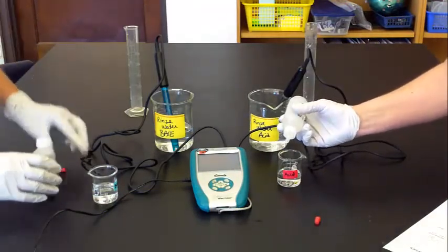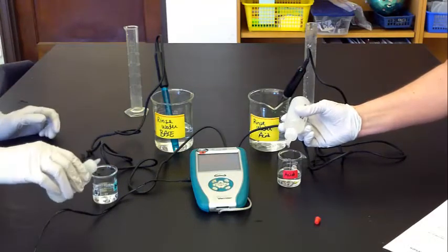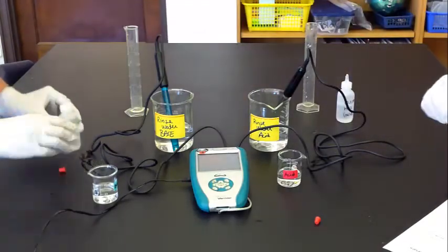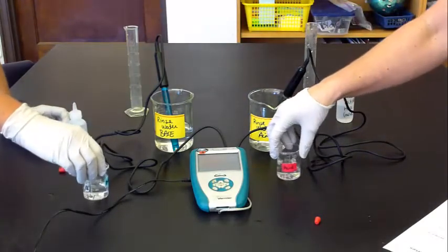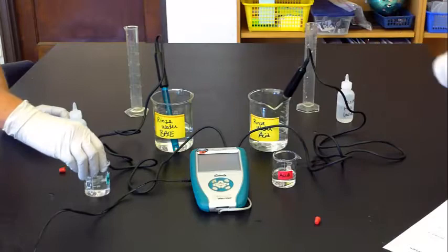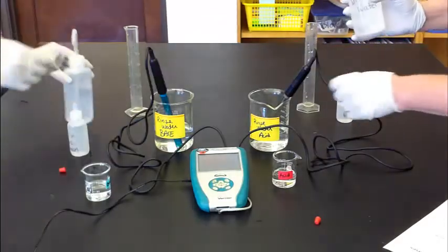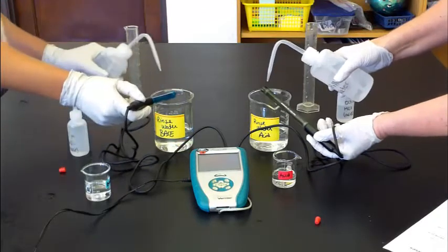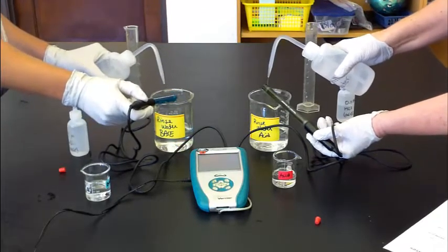So before you use your probe in your next solution, you simply rinse off the probe, especially the glass bulb. There will be fluctuation in the numbers. Once it stopped jumping around, just take a measurement.